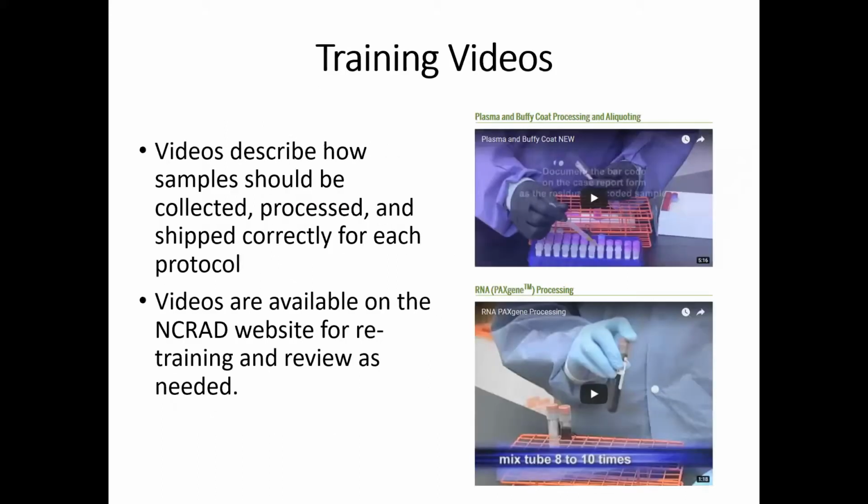We also provide training videos. These videos describe how samples should be collected, processed, and shipped correctly for each protocol. Those videos are available on the NCRAD website, and we use them for retraining and also for training of new staff. You can see some examples of those videos on our website.